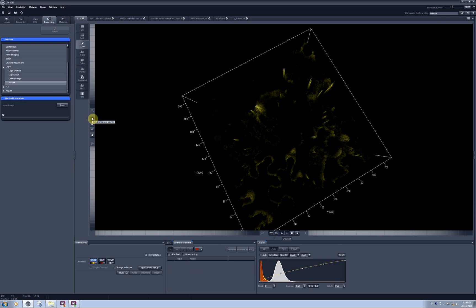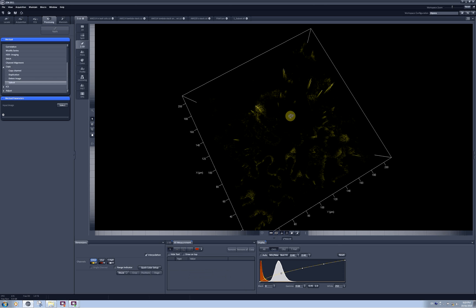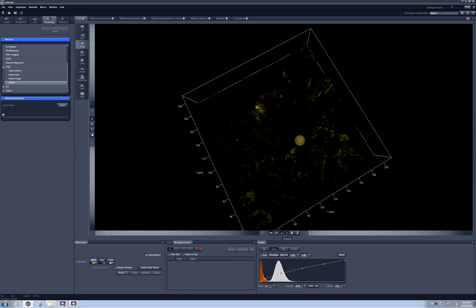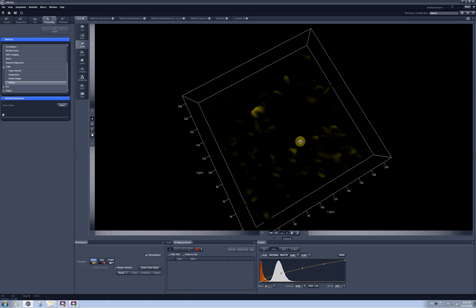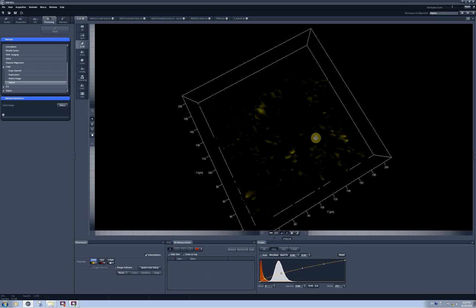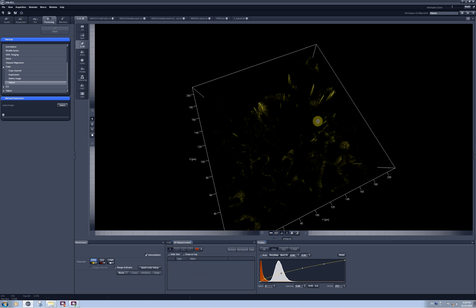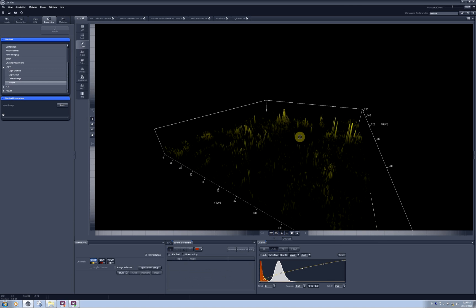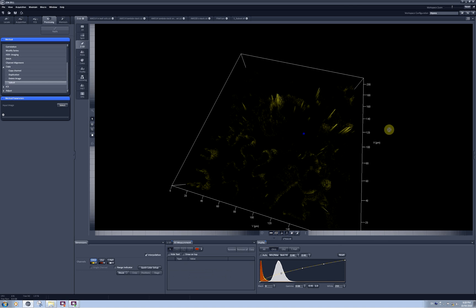There are some tools available here. The first one select measure points. I truly do not understand what the hell does it do. It doesn't show me any measurements. It shows some blue dots which you cannot even place anywhere.